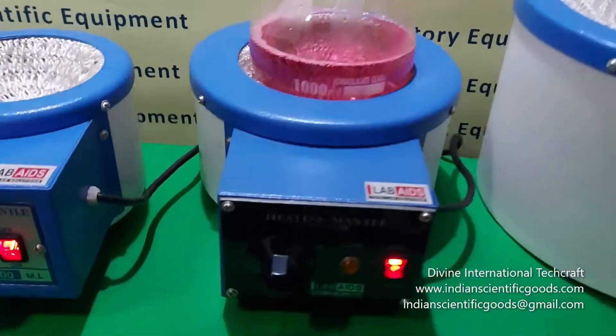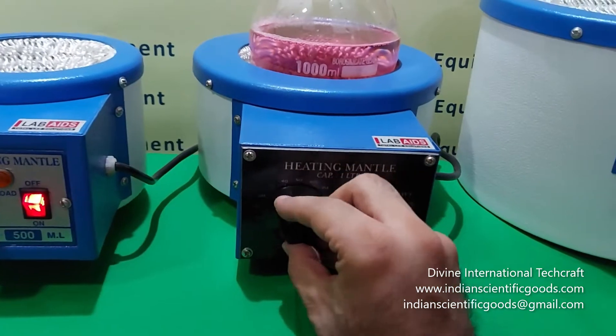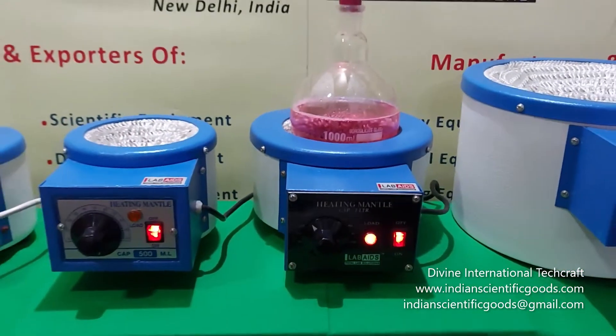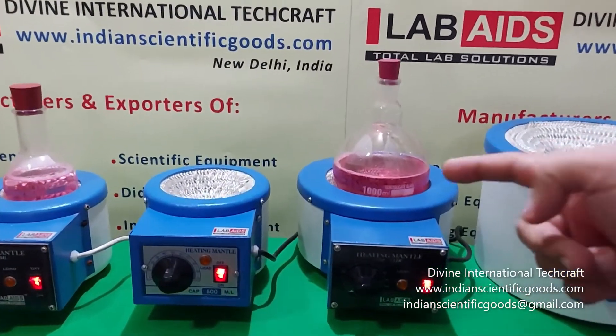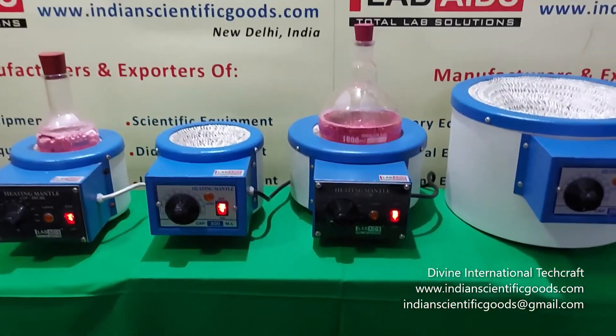The temperature of these heating mantles can be controlled using an energy regulator. The temperature range is from ambient to 400 degrees centigrade. Glass wool insulation is provided between the walls to prevent the outer body from overheating.